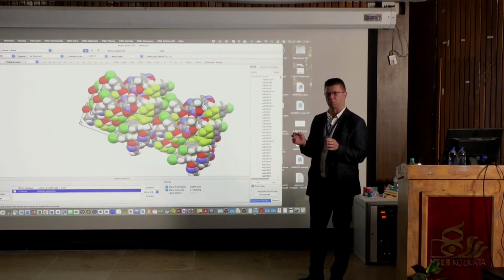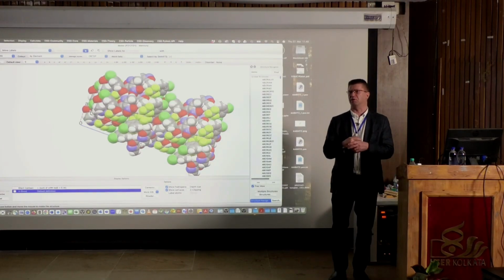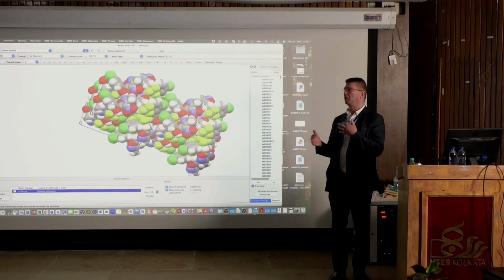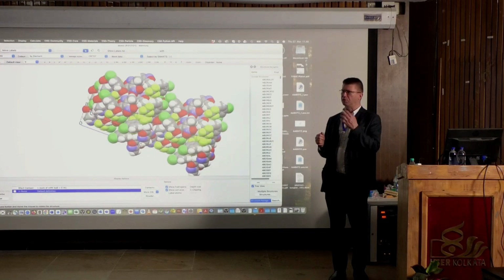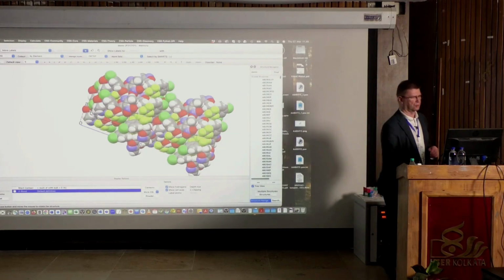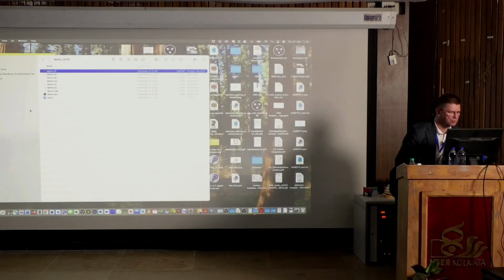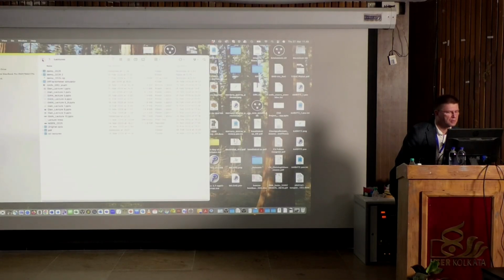We don't have time to go through and have a rehearsal or practice with these instruments, but if you just download the program and you have the file, then you can play around with this. Or with your own, maybe now or in the future, if you're doing this kind of work, you can use this for that purpose. But now, let's move to the final thing.